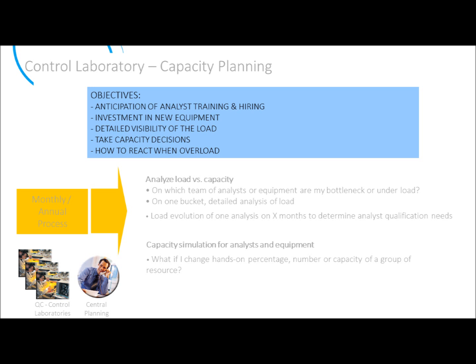Ortems is first of all, at a monthly and yearly view, a capacity planning tool that will allow you to anticipate and to invest in your new equipment or your new hiring and your new training for new analysts. It will give you better visibility and allow you to take capacity decisions and to know how to react when you have an overload.